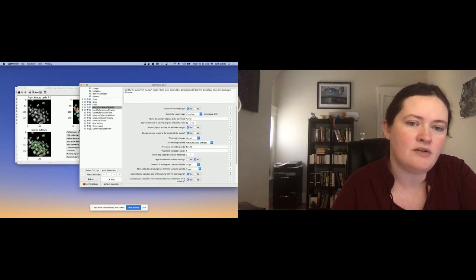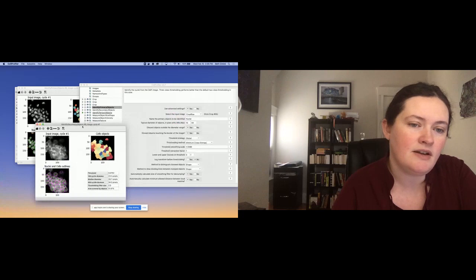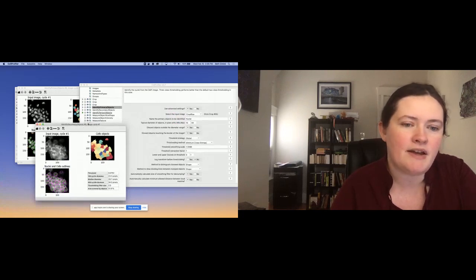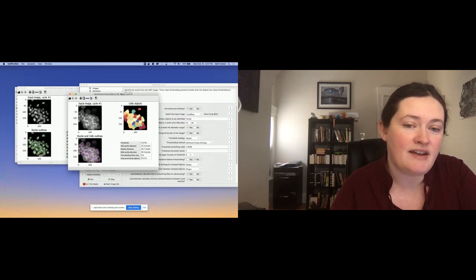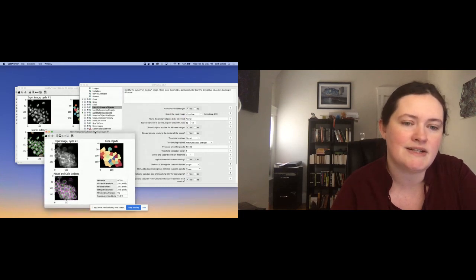Once I have my nuclei here in my DAPI channel, I can grow those out into cells. Typically, we recommend that you do that, because nuclei are often a lot easier to find, and if you're working in a mononuclear cell line, it is a lot easier to start from a nucleus and build a cell around it, but you don't have to. You can find cells.